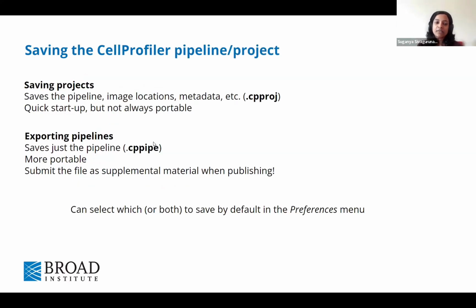And you can also save the whole project as a CP project file, which saves the whole pipeline along with your images. But if you would just like to save the image analysis steps, please feel free to export the pipelines as CP pipe. This does not save your images, but saves the image analysis steps that you have.